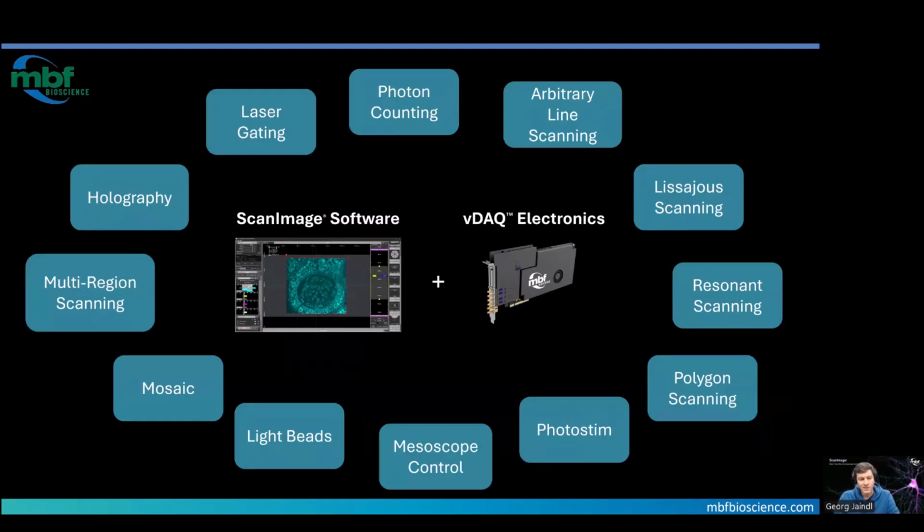So there's a wide variety of features that are available to you. But the most important thing to remember is we want to help you enable your experiment. So if you have a specific experiment configuration in mind, you can always reach out to us and we can help you make your vision become reality.